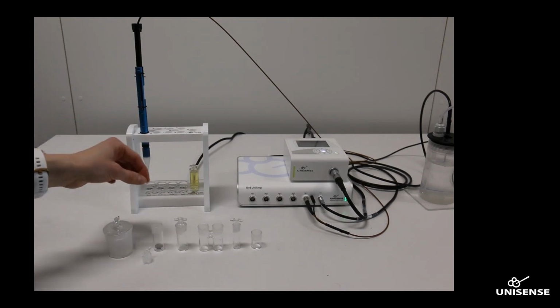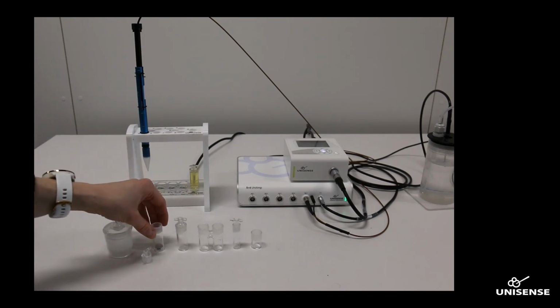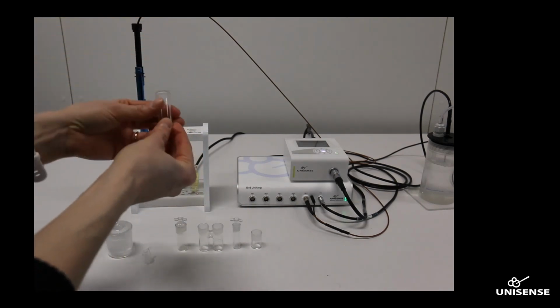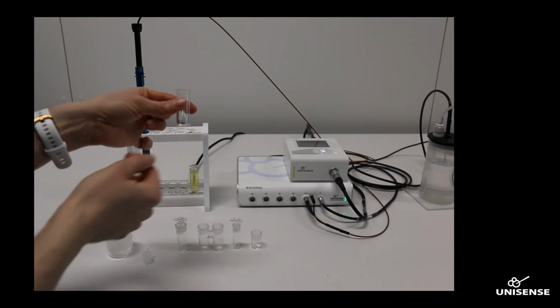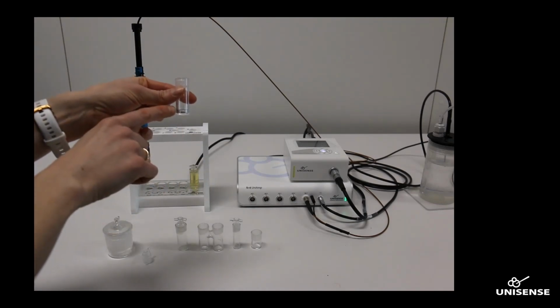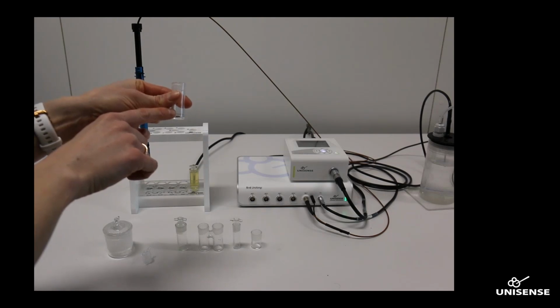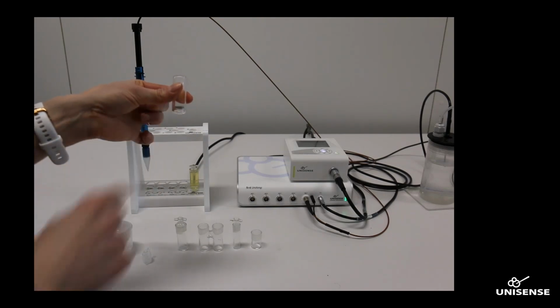If you are measuring respiration rates or metabolic rates on a small egg or a small animal that needs to be protected from the magnet at the bottom, you can add a small metal net to the bottom of the chamber, and you can then put your sample on top of this metal net to protect the sample from the stirring.